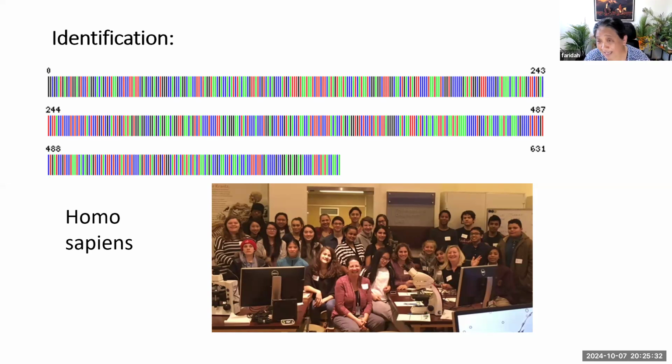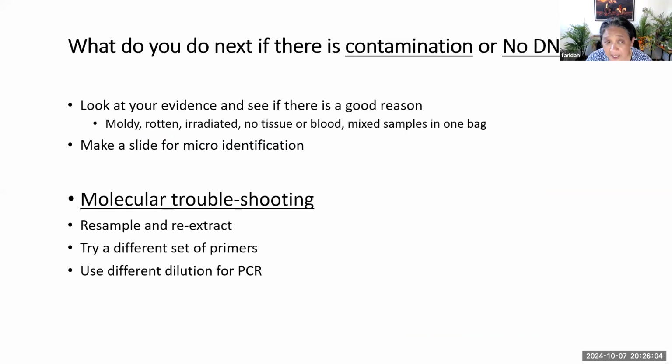And our ID is only good for what little tissue that we sample. So there could be a bird in there, but what we sampled looked logical to us. That is the piece that we sample. It was Homo sapien. Sometimes we have to take the tissue because there is no tissue that's obvious, so when we take the tissue, it could jolly well be from Homo sapien. So when we sit down, we say, no, that is certainly not correct. So what do we do with a contamination?